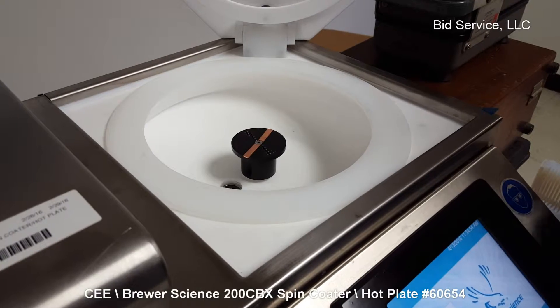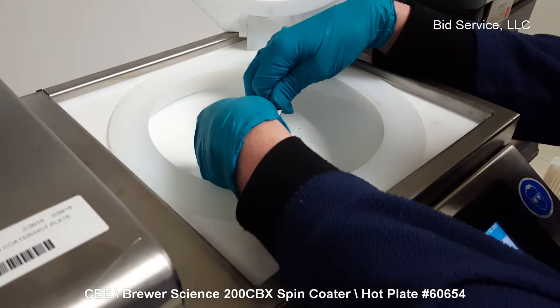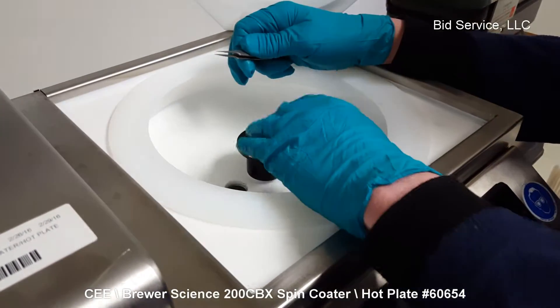For purposes of our demonstration, I'm going to plug the vacuum right here so it senses that there's a wafer on there, and we can see our timing mark.